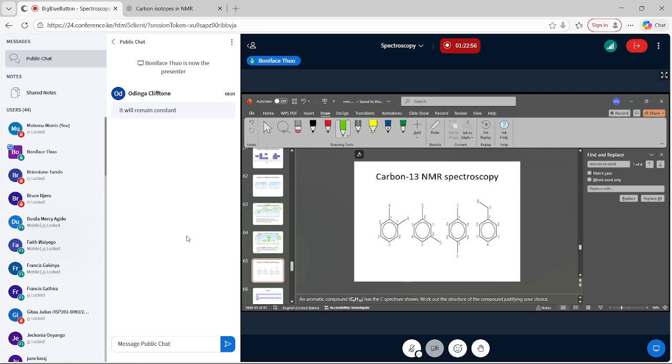If you consider the second compound, where you have the 2 methyl groups attached meta to each other, then the aromatic carbons are in 4 different environments, which does not correspond to what we observe in the spectrum. In the third case, the methyl groups are para to each other, which makes 2 chemical environments for the aromatic carbons, which violates the observation.